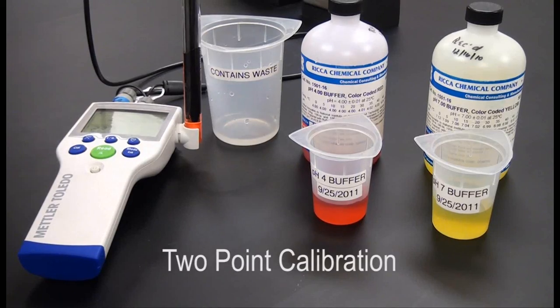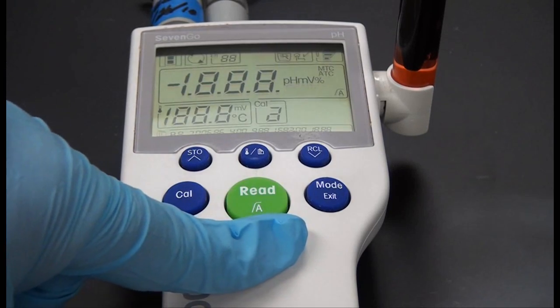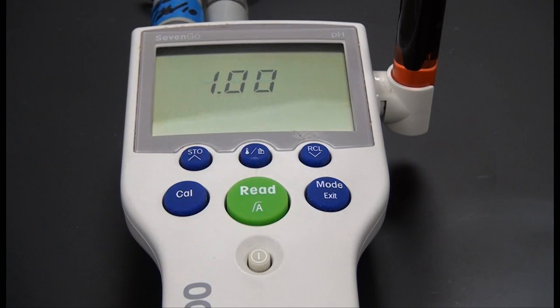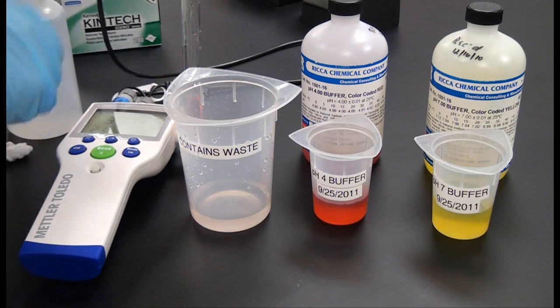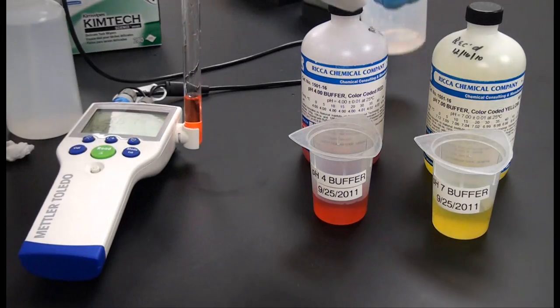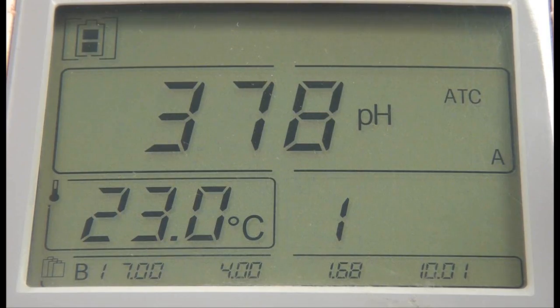To perform a 2-point pH meter calibration, power on the meter. Rinse the electrode with deionized water and blot dry with a chemiwipe. Place the electrode in a calibration buffer solution and press the CAL button.